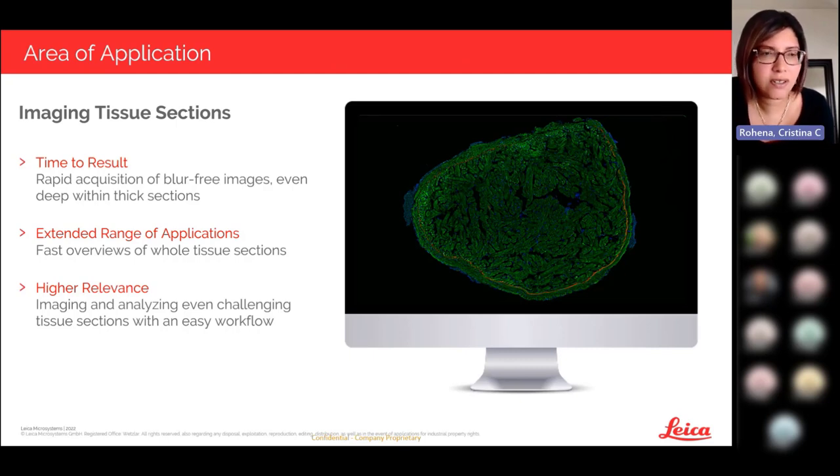With our upright tissue imagers, you decrease the time to results. So you have rapid acquisition of blur-free images, even deep within thick tissue sections. You're able to get the fast overview of these whole tissue sections, and you're able to get higher relevance by imaging and analyzing even thick and challenging sections with an easy workflow. So regardless of whether you're investigating neurite projections, lymph node architecture, or regenerative responses, you can effectively remove that out of focus blur with your Thunder tissue imagers in real time and get maximum ease of use.